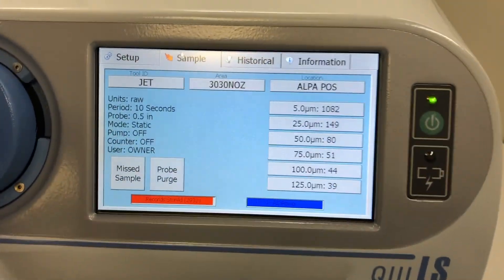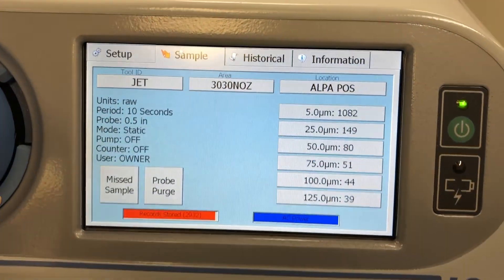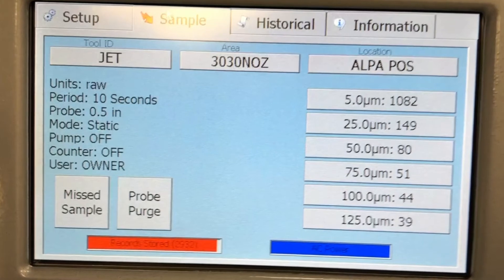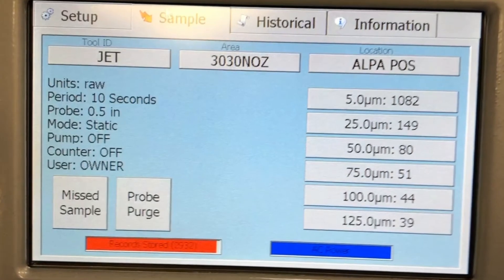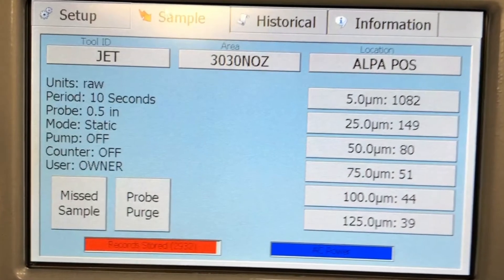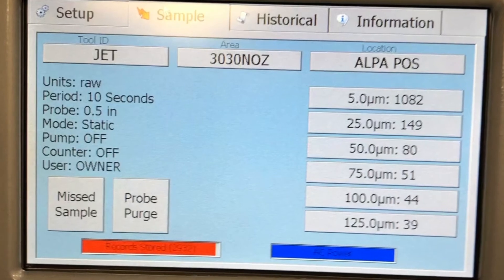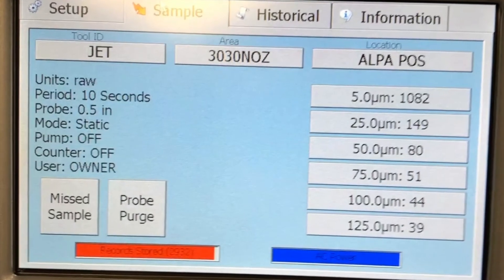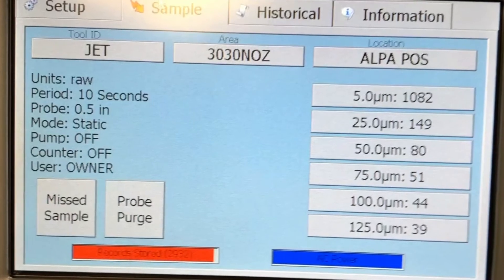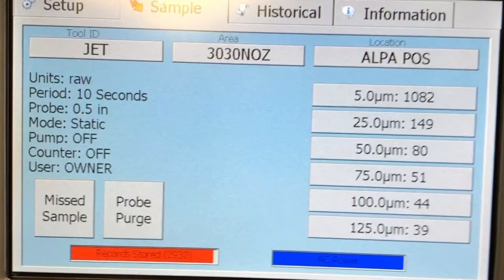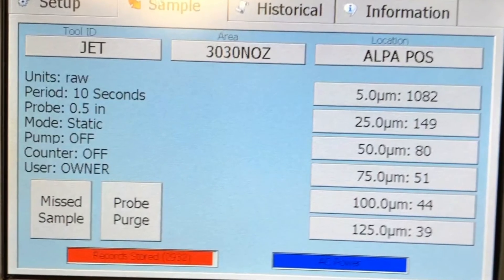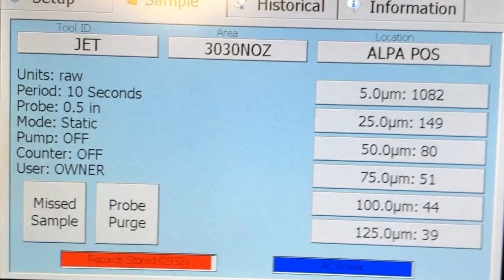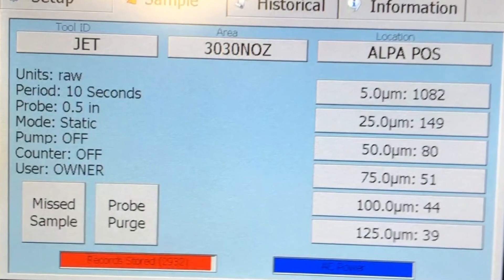Notice how the Q3LS counted 1,082 particles greater than 5 microns, the smallest bin, and 39 particles greater than 125 microns, the largest bin. The screen also shows the settings, probe type, how many measurements are stored, a button for purging the probe, and a missed sample button.